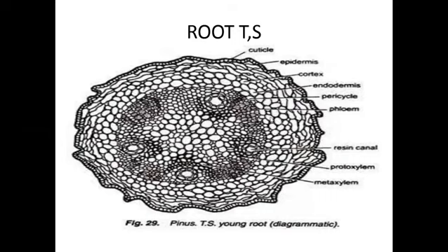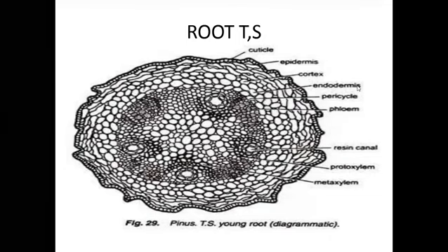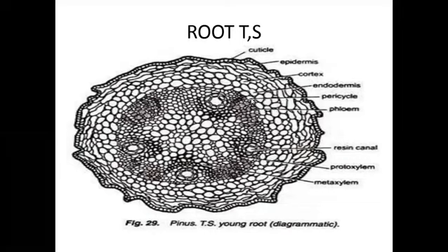At the center region, the stele is present. The stele is surrounded by endodermis, which is a single layer. Below the endodermis, a single layer of pericycle is present. From this pericycle, lateral roots are developed in the Pinus root. The endodermis is also called the starch layer.